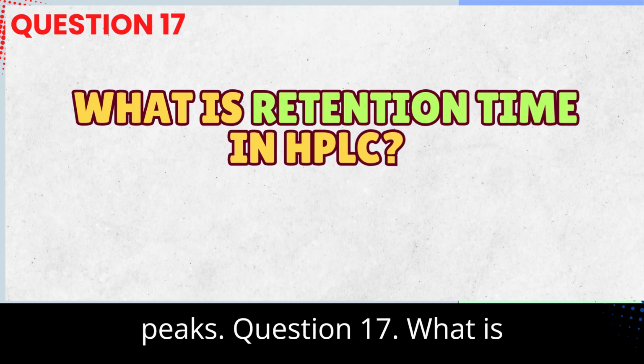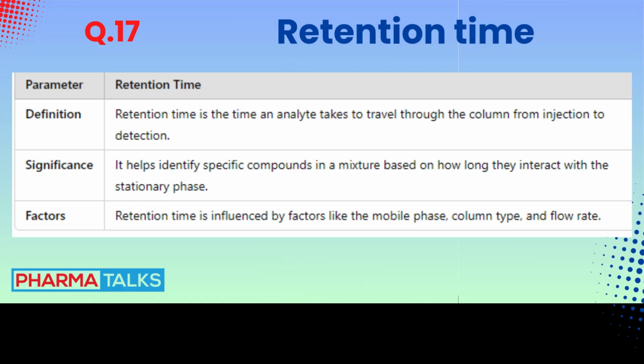Question 17. What is retention time in HPLC? Answer.